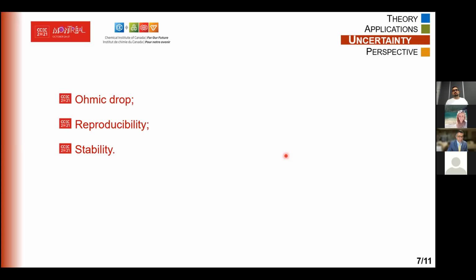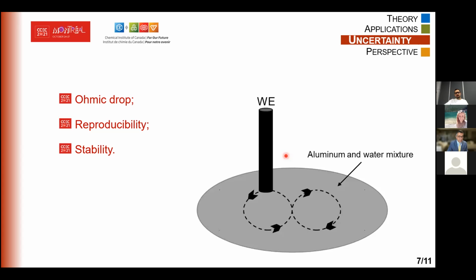This is usually just overuse of it. Maybe it falls off or degrades over time, and the reading is inaccurate. This could be corrected by cleaning the working electrode in an aluminum water mixture, where you're able to remove all the impurities on the surface of the electrode and have the process be used again. In this case, you can reproduce it as many times as you want, or until the reproducibility and stability degrade again. In addition to placing it back in the solution, you'll need to sonicate it. And then finally, you can also add a CV pre-treatment before any reaction, before any characterization.